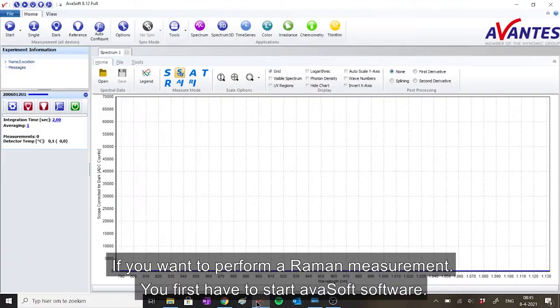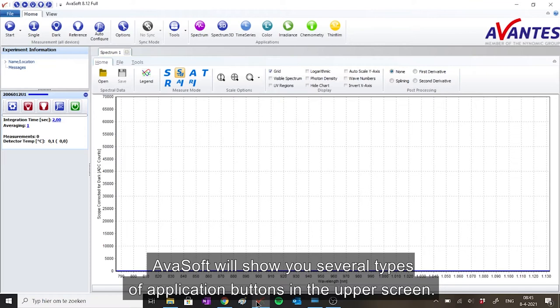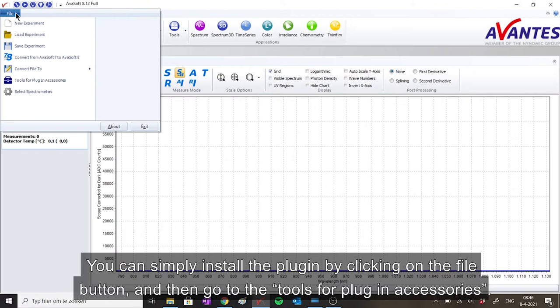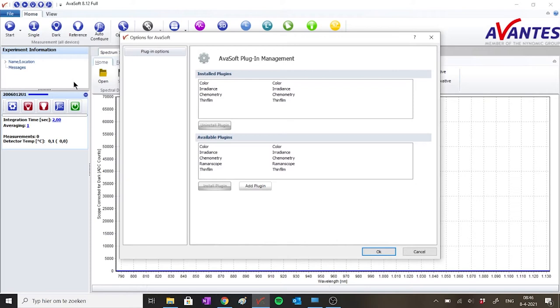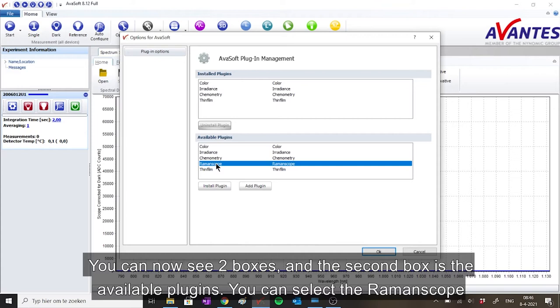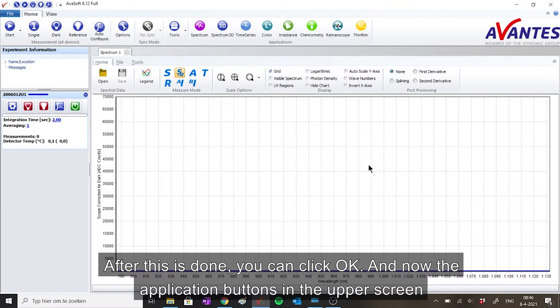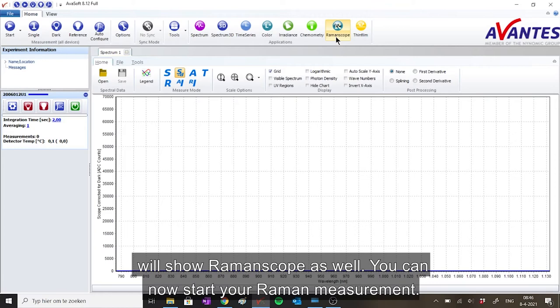If you want to perform a Raman measurement, you first have to start AvaSoft software. AvaSoft will show you several types of application buttons in the upper screen. If Ramanscope is not there yet, you have to install the plugin first. You can simply install the plugin button by clicking on the file button and then go to tools for plugin accessories. You can now see two boxes, and the second box is the available plugins. You can select the Ramanscope and then click on the install plugin button to install it. After this is done, you can click OK, and now the application buttons in the upper screen will show Ramanscope as well. You can now start your Raman measurement.